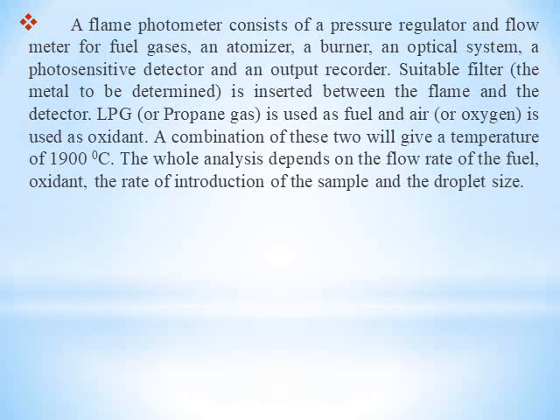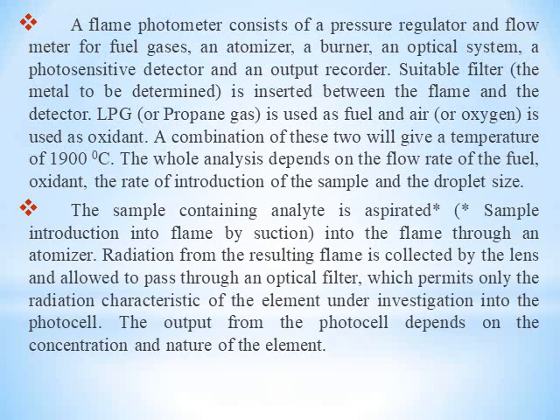Now sodium carries a positive charge, and it immediately gets excited from the ground state into the various excitation levels, and when it comes back, it emits a radiation. That radiation is recorded in the flame photometer. The analysis depends upon the flow rate of the fuel and the oxidant, and the rate of introduction of the sample and the droplet size.